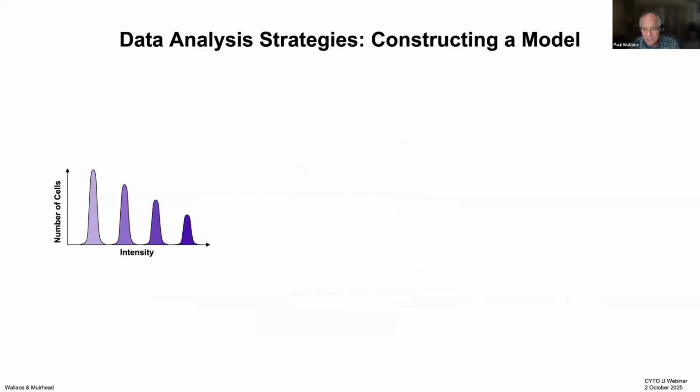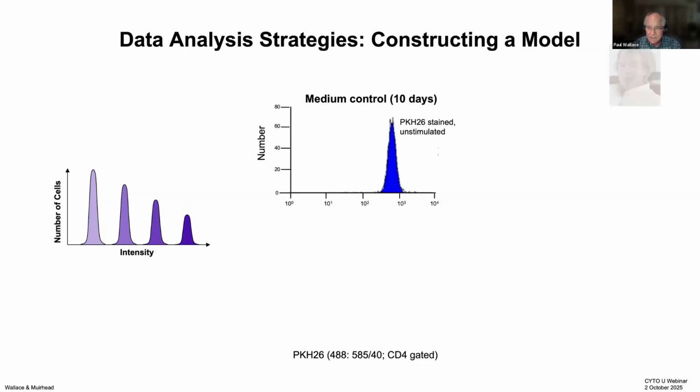The ideal proliferation dye would give baseline separation between peaks corresponding to successive daughter generations, making peak modeling software unnecessary. Sadly, even with the relatively tight intensity distributions at T0 and a strong stimulus that gives a relatively synchronous response, we have yet to see one that behaves like this.